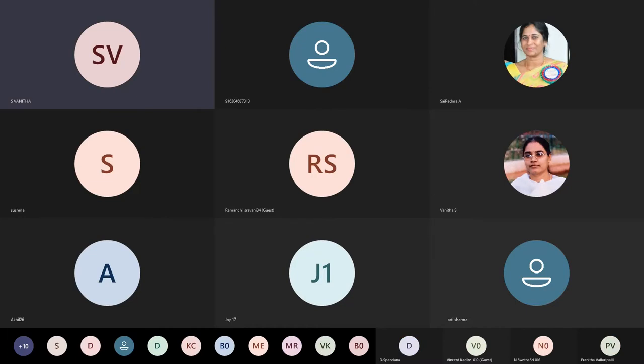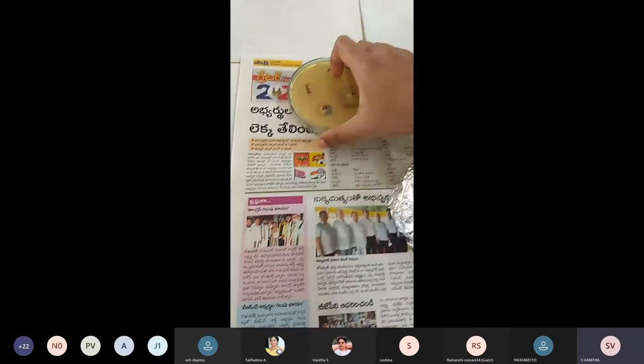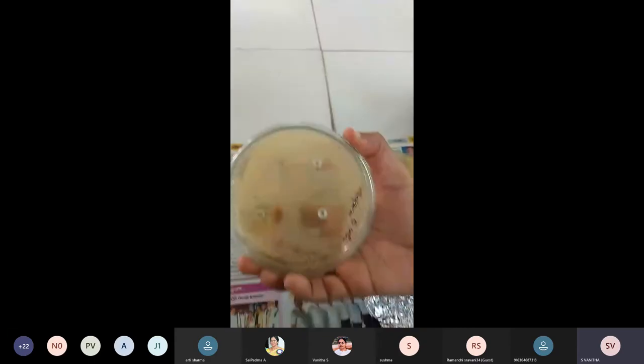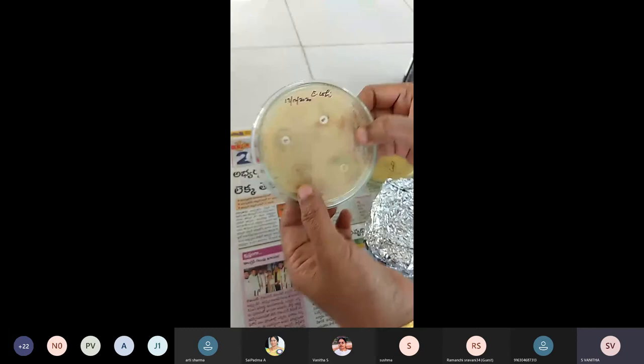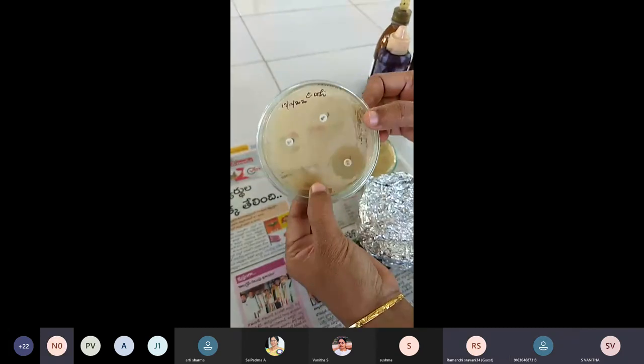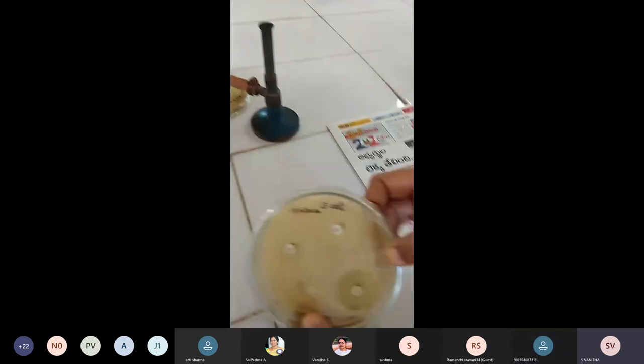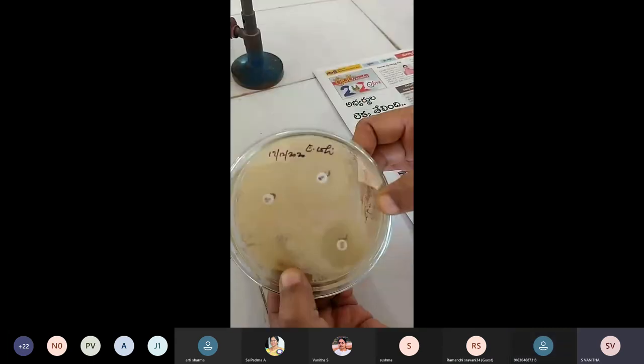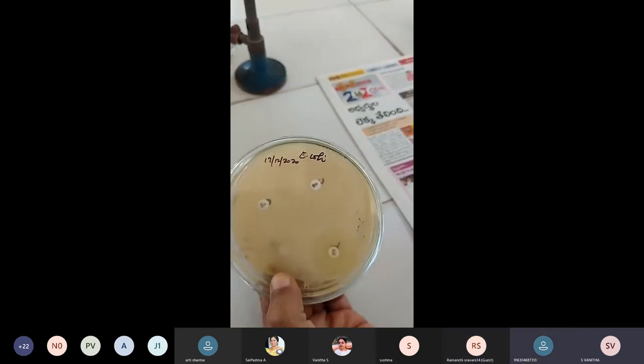Students, we will show you the results of the previous experiment. Can you tell me what this is? Are you able to see what it is? Antibiotic sensitivity. Yes, now it's clear. Okay, what is the label written?